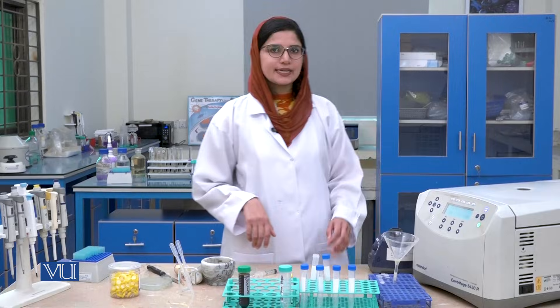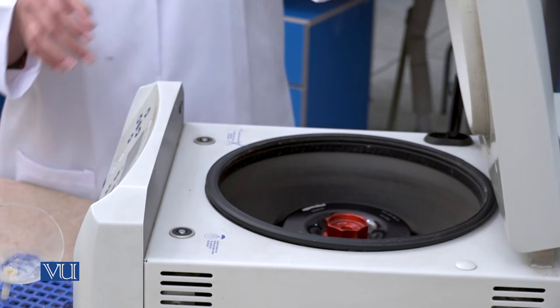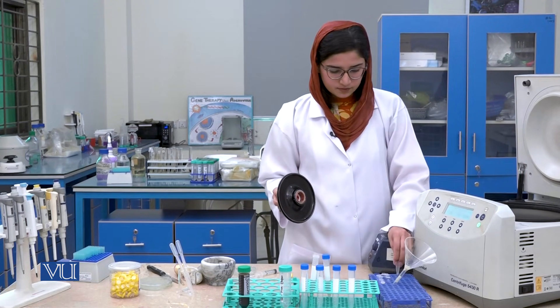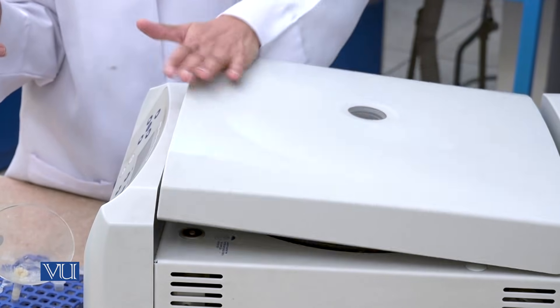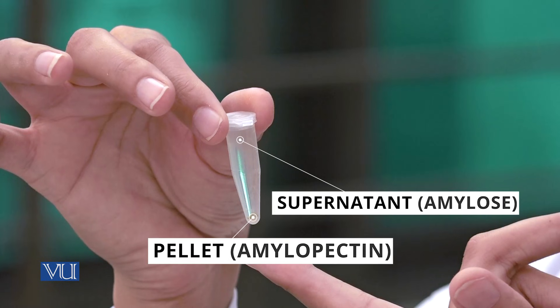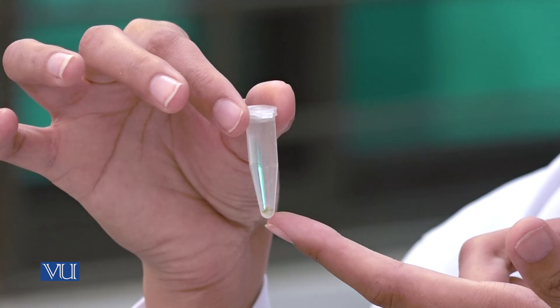After completion of centrifugation, we will take out the eppendorfs. We will observe the supernatant and the pellet. The supernatant contains amylose, and the pellet contains amylopectin. For amylopectin, there is a separate detailed purification procedure, after which the detection test using iodine solution can be performed.